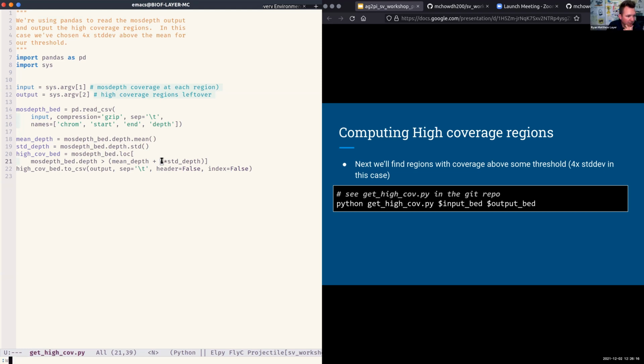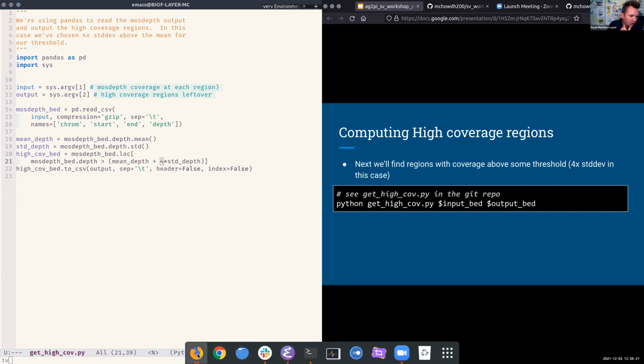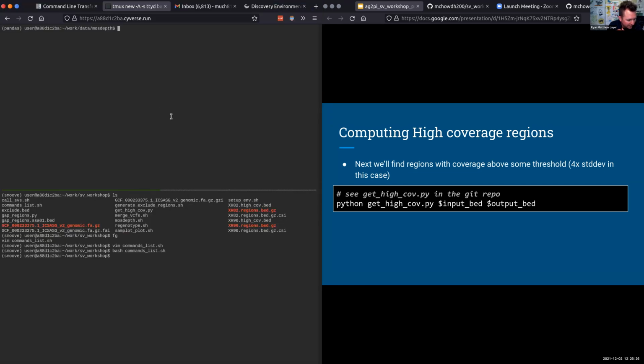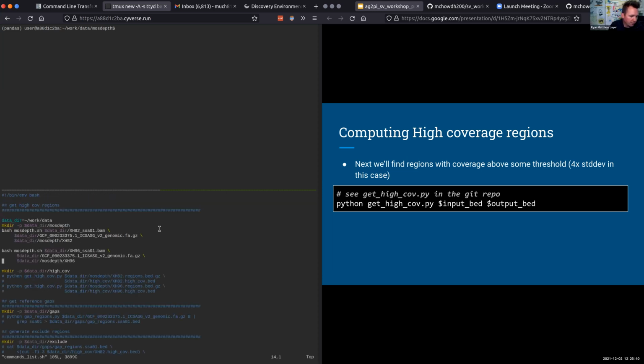And it depends on if you're interested in a particular element, it might occur many more times than 4. So if you have a gene that exists many times, you'll want to adjust that 4. That 4 is a nice general threshold for looking at genome-wide structural variations. But as Murad said, your experimental conditions might need for that to be raised.